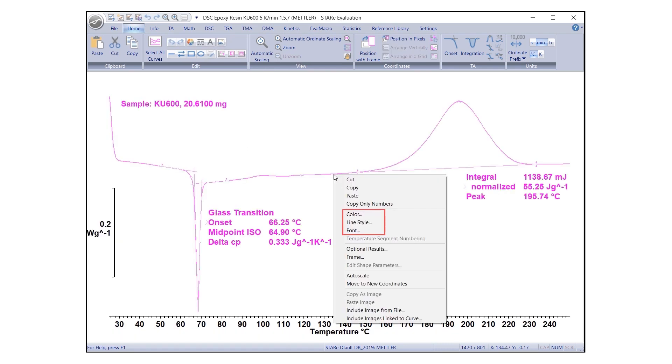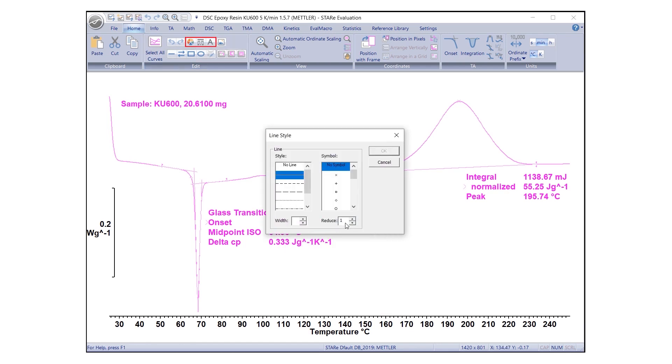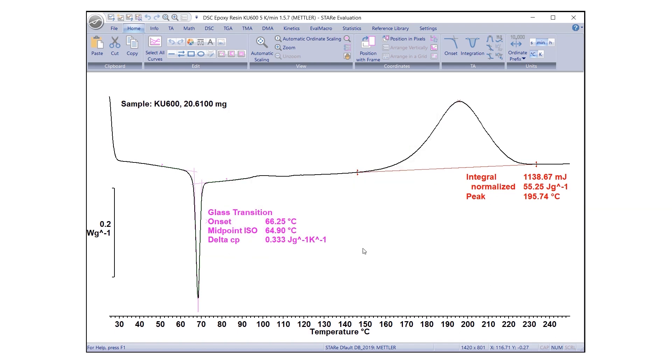Several colors, line styles, and fonts are available to help improve the presentation of results. These formatting options can be accessed under the Home tab or by right-clicking on the selected curve or text.